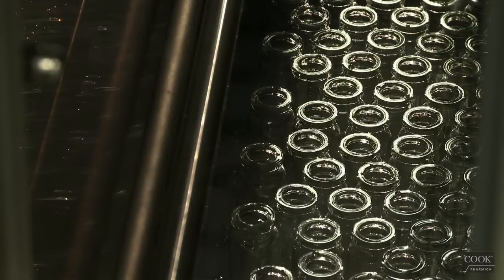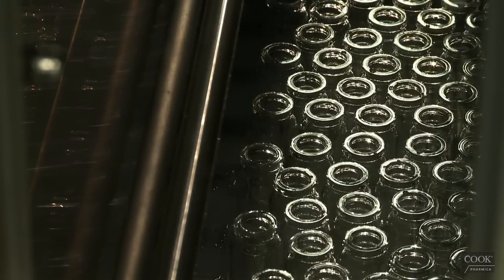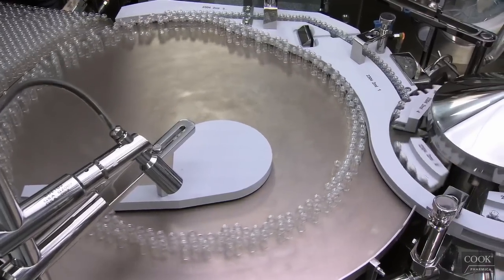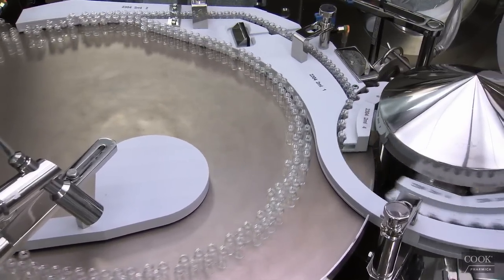Upon leaving the washer, the vials enter the depyrogenation tunnel which is equipped with a sterilizable cool zone. The depyrogenation tunnel feeds vials onto a turntable, staging them to go from continuous motion to the walking beam intermittent motion.